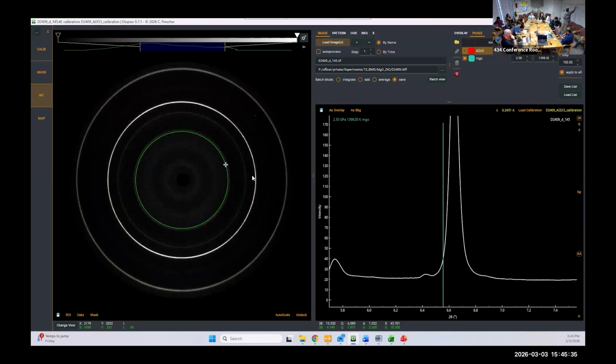But when we start to deform it, so add extra stress from the top and the bottom, now the grains that are going to diffract in this direction, so let's say those are these ones, they're going to be closer together than ones that are this way, because we're pressing harder onto this lattice plane. So then we get an ellipse.